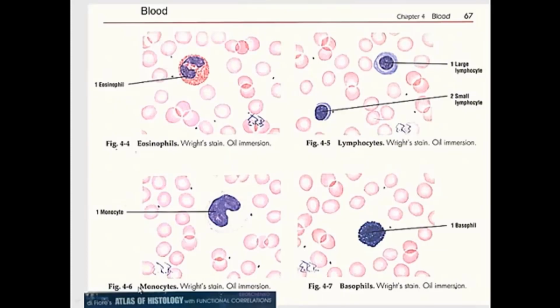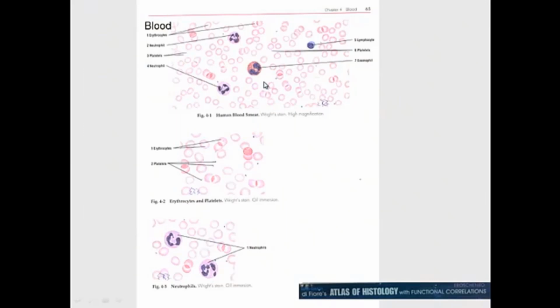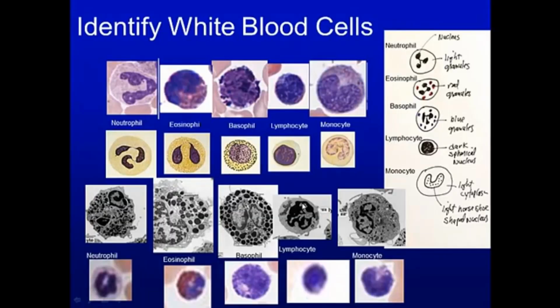Now, as we look at different components of microscopy, one thing that we want to see is blood cells. This is an individual cell, another individual cell, and by looking at blood cells, you can see individual ones, and don't be confused with the cells in the tissue. This is an eosinophil, monocyte, basophil. Here we see eosinophil, neutrophils. As we see, these are all from the atlas and identified for you.